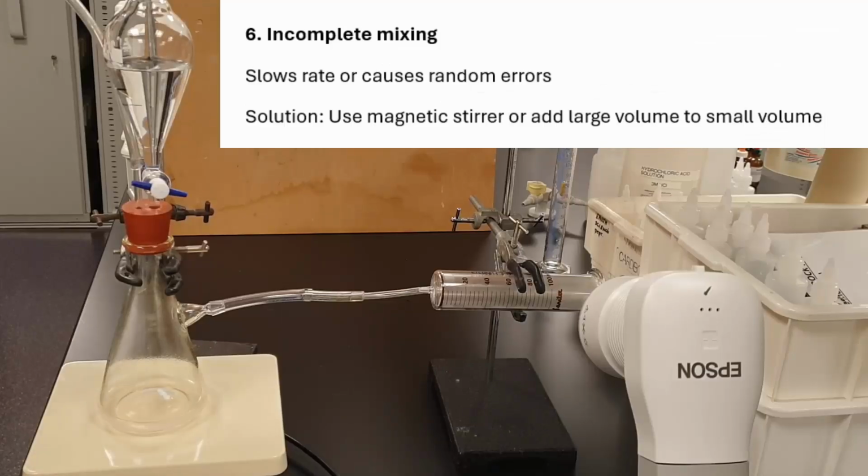Now, incomplete mixing is what we're dealing with next. You'll see here that there's a magnetic stirrer at the bottom, and I will turn that on and it'll start spinning around, and then I'll release a certain amount of volume.